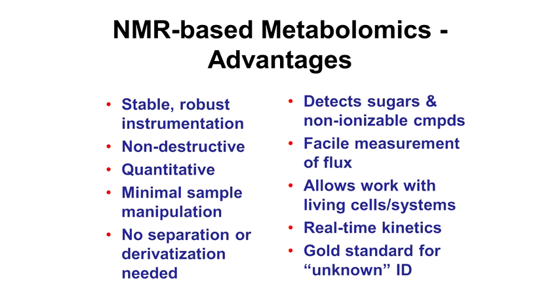They are, if you want, dirty instruments and have to be regularly cleaned and regularly tuned. NMR is a non-destructive technique, so it doesn't wreck materials. You can remeasure the same sample over and over and over again. Nothing disappears, nothing is burned up. In contrast with GCMS, LCMS, or any other technology, those samples are lost. They are destroyed as part of the analysis process.